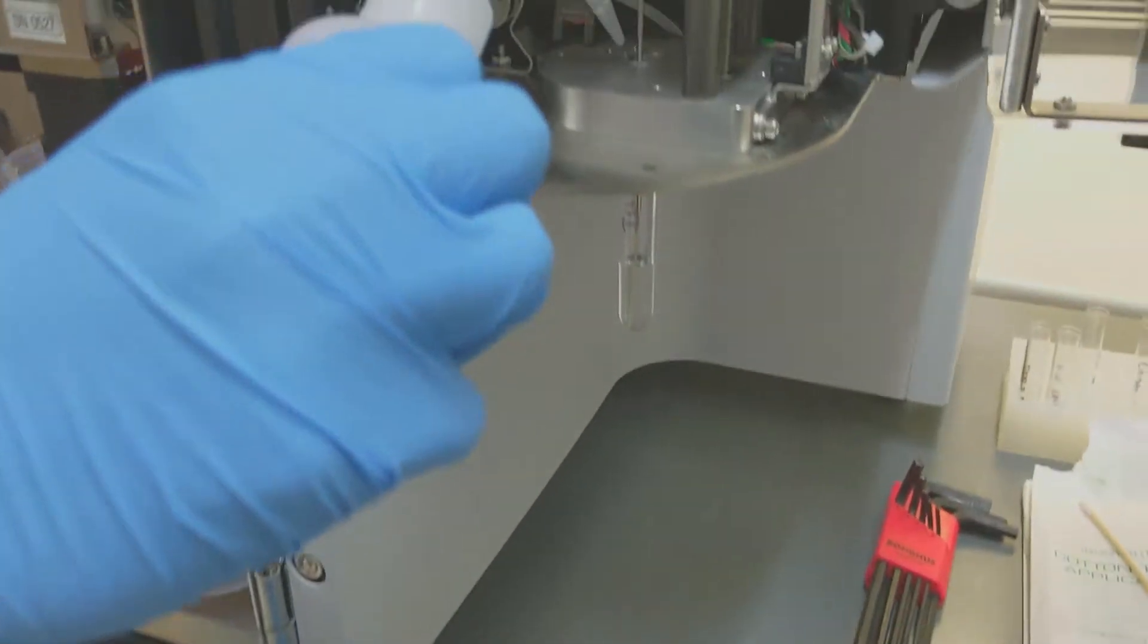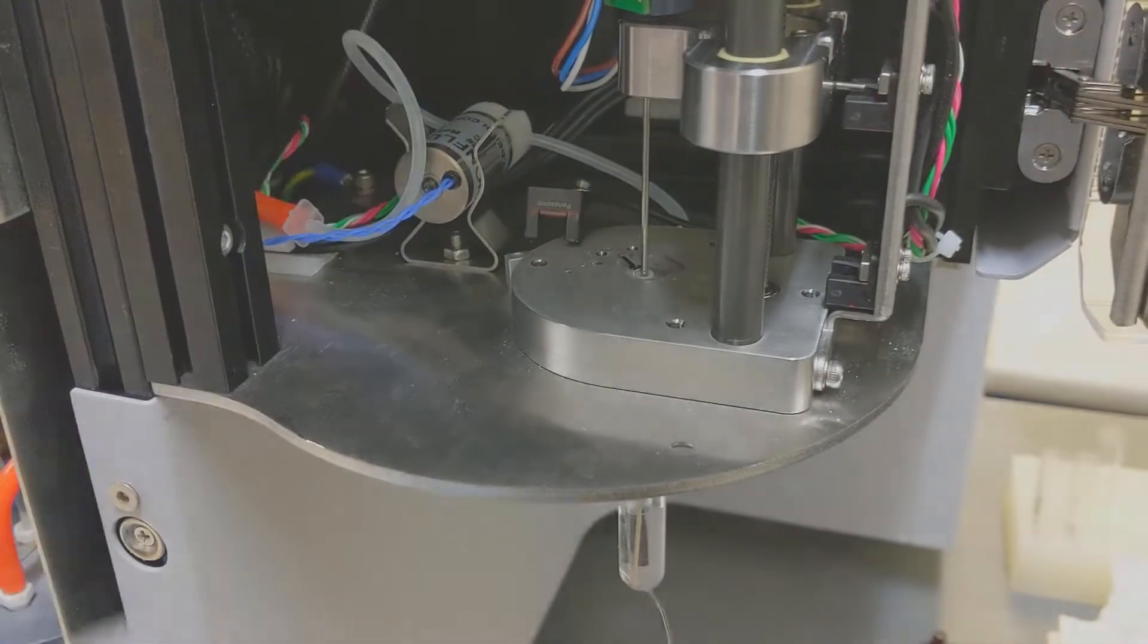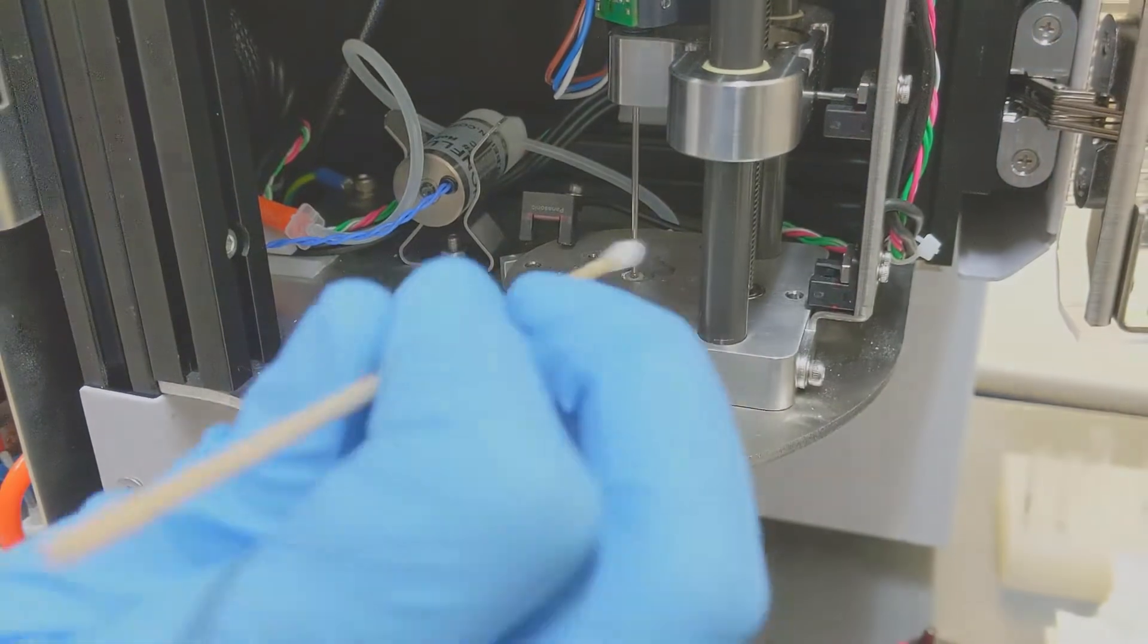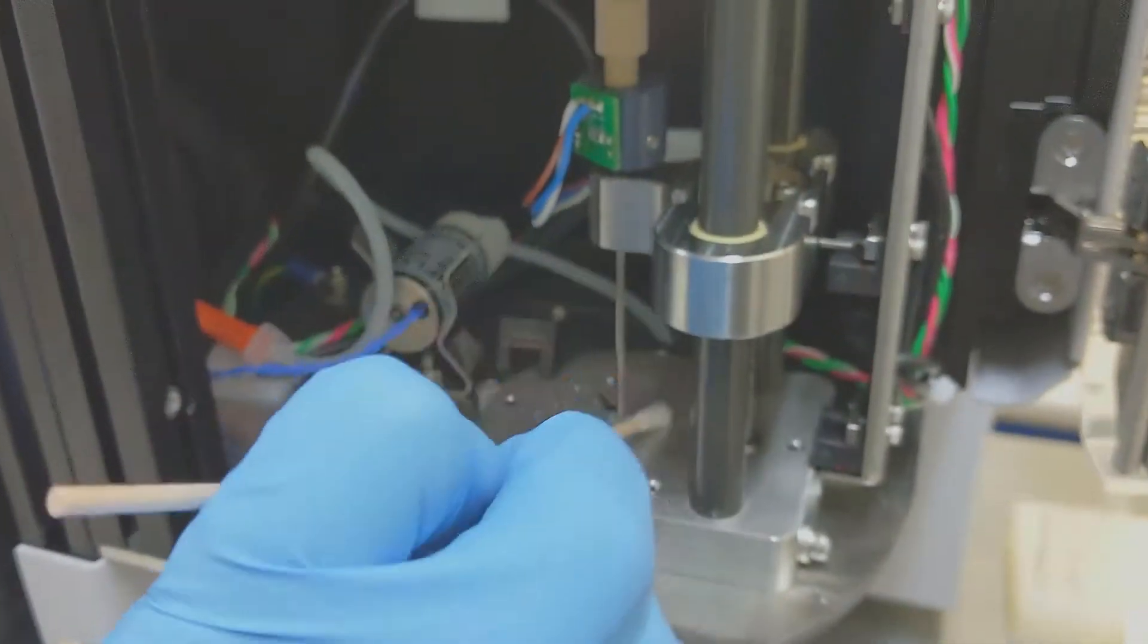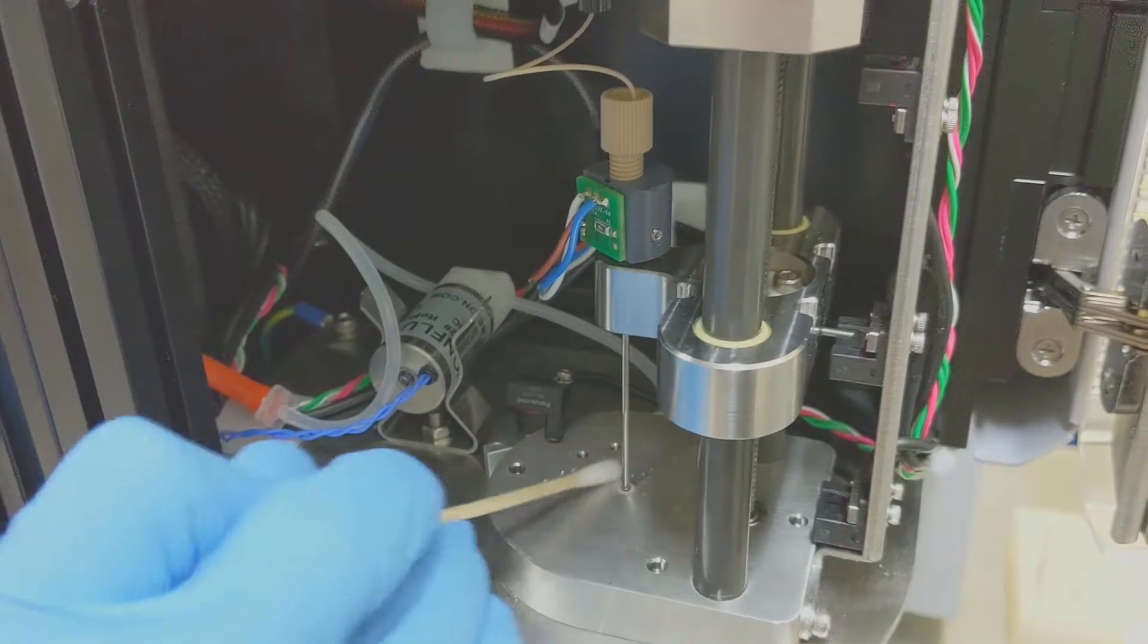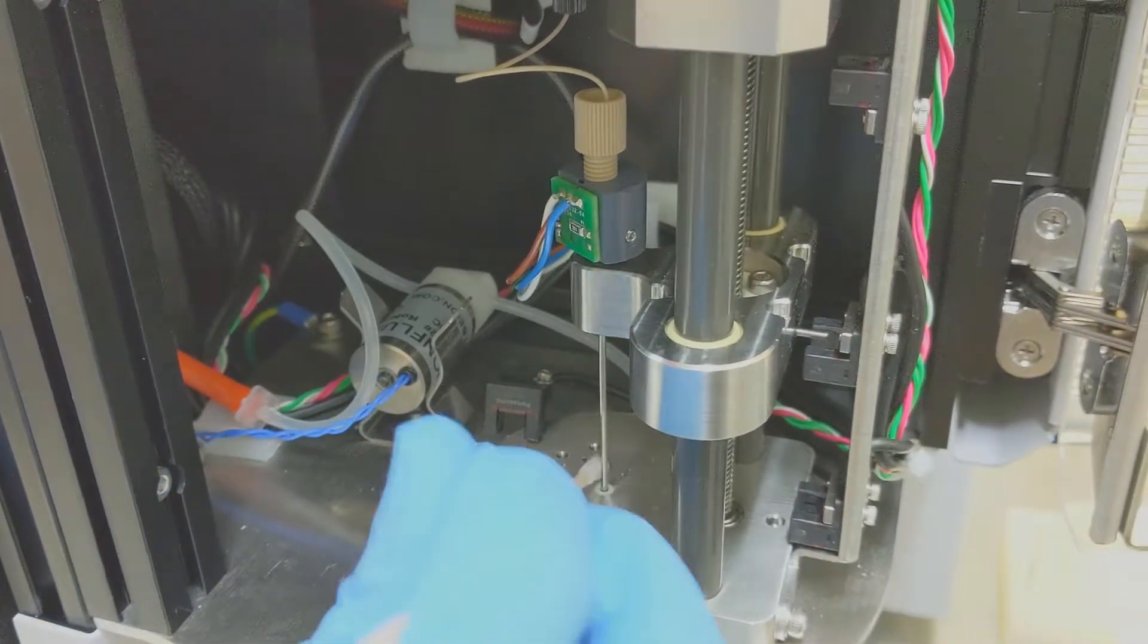Next grab your DI water and really wash the area really well. We want to flush out any salt crystals that might be up there and then you can dab up the salt and dirt with those cotton-tipped applicators.